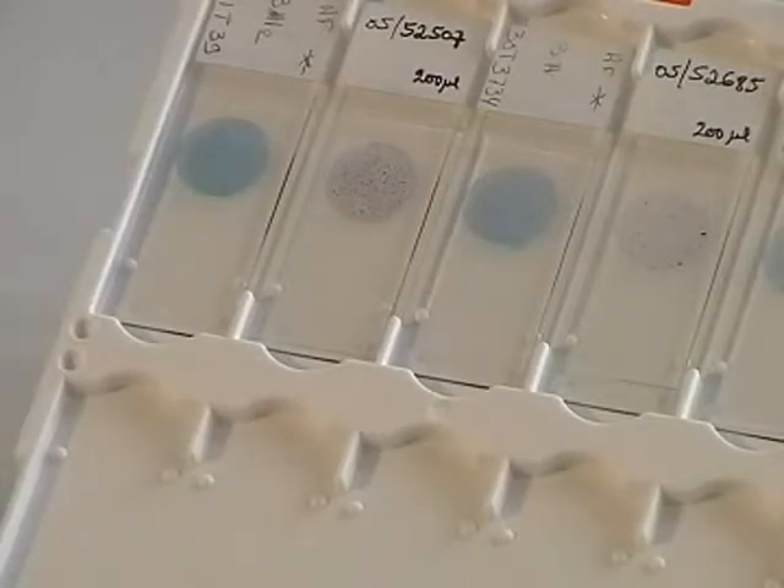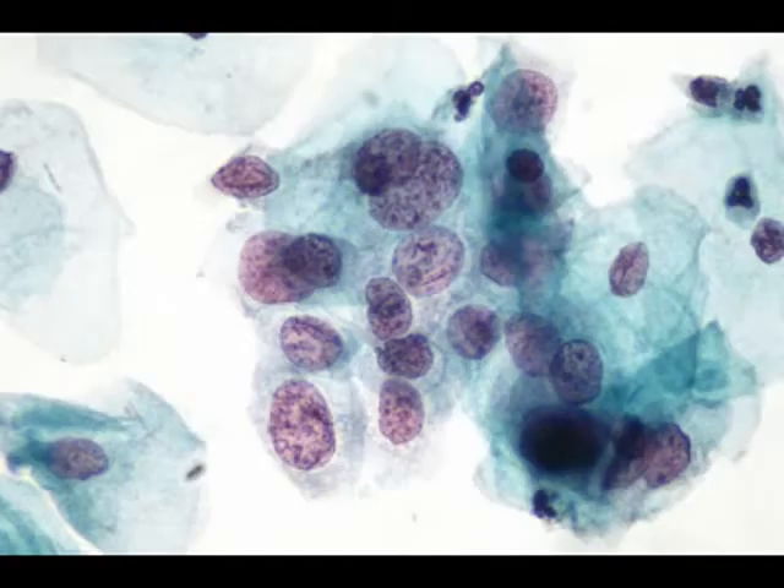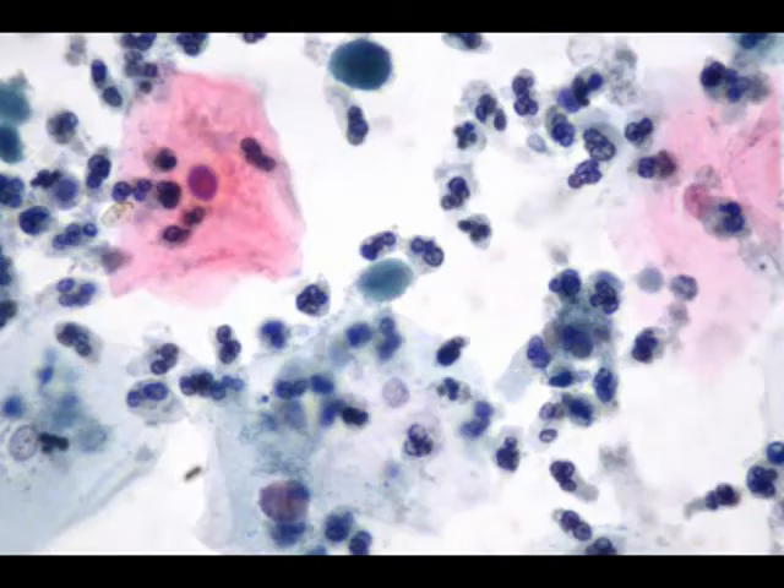LaboNor presents Turbitec Thin Layer Technique, an alternative for your conventional pap smear. Turbitec has high throughput and improved quality. In comparison with the conventional smear, Turbitec reduces the problems of bad transfer quality, bad fixation, and poor smear quality.